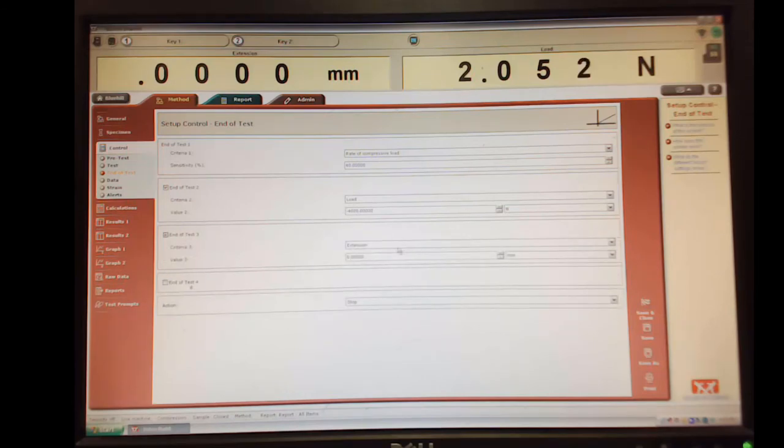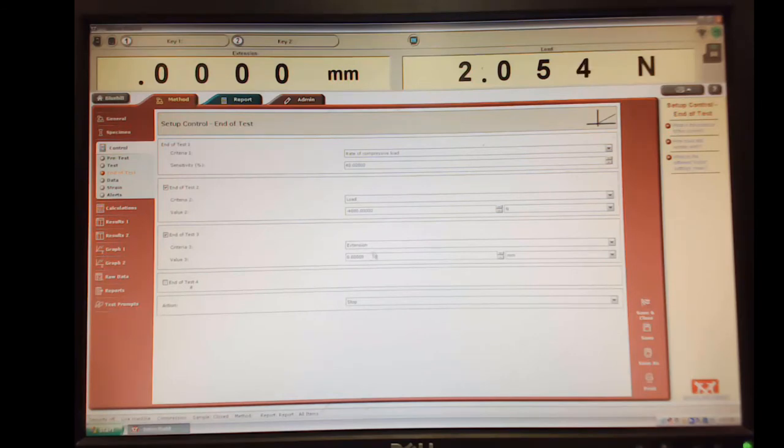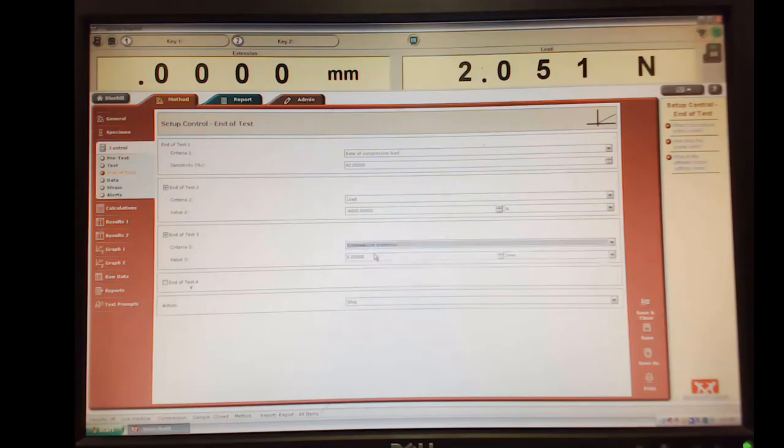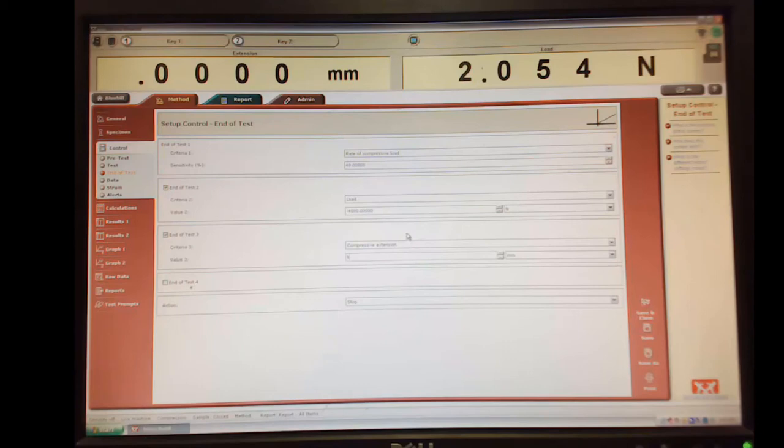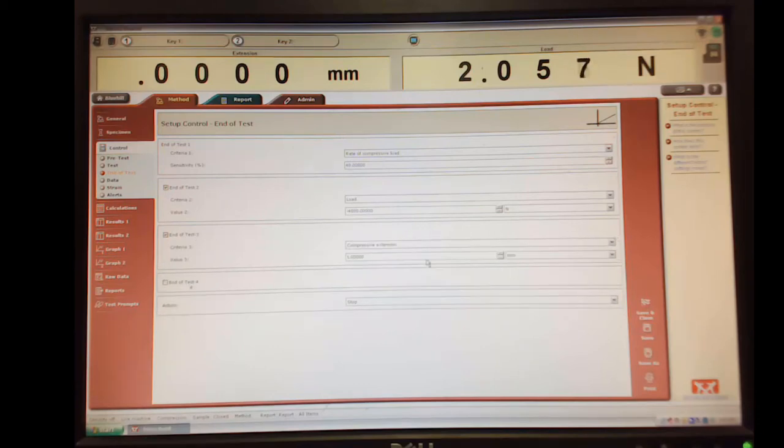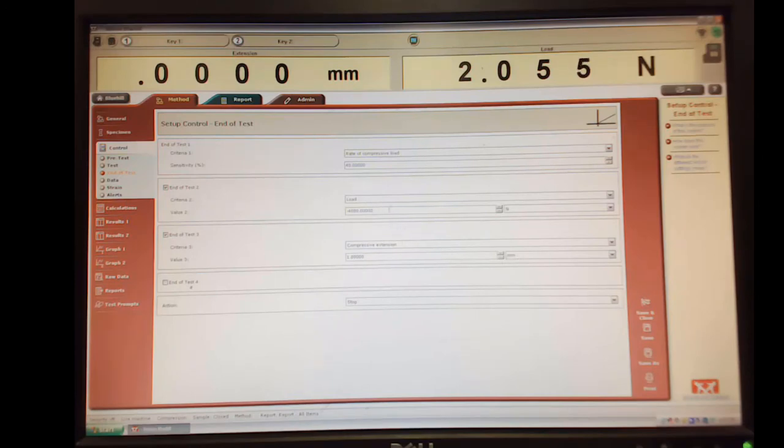Okay, our final criteria is how far we want to move. And like I said, I think one millimeter was about as far as we wanted to move. So we can say compressive extension of one millimeter. So that would take a minute to get there if we got to one millimeter before we get to the load that breaks it. And so that's all we need to do for that.